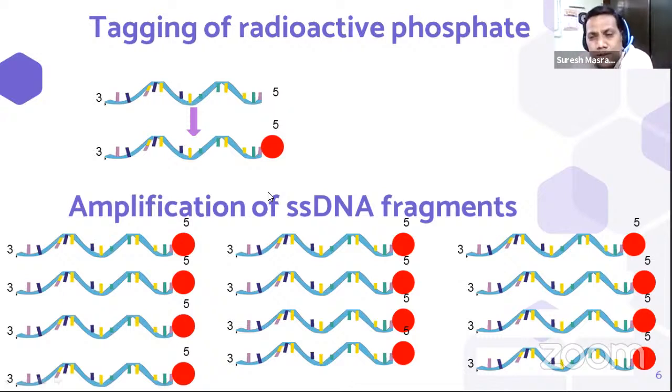Obviously, for the process of DNA sequencing, we require a single stranded DNA. Thus, up to the higher temperature stage, we allow the PCR, because at higher temperature there is the process of denaturation, and denaturation splits all double stranded DNA into single stranded DNA. We arrange the process of PCR and have all the single stranded DNA.